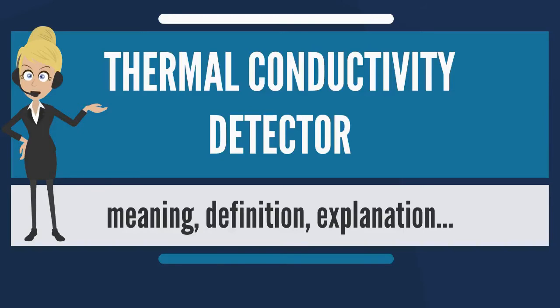The TCD is a good general-purpose detector for initial investigations with an unknown sample. Since the TCD is less sensitive than the flame ionization detector and has a larger dead volume, it will not provide as good resolution as the FID. However, in combination with thick film columns and correspondingly larger sample volumes, the overall detection limit can be similar to that of an FID. The TCD is not as sensitive as other detectors, but it is non-specific and non-destructive.